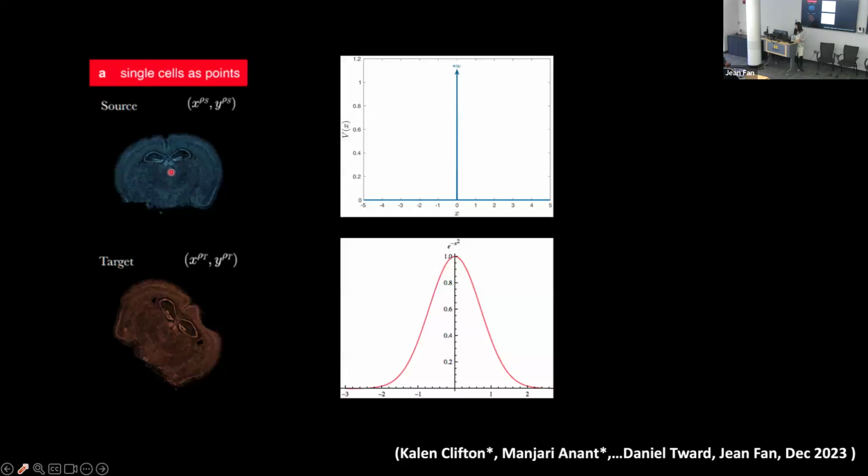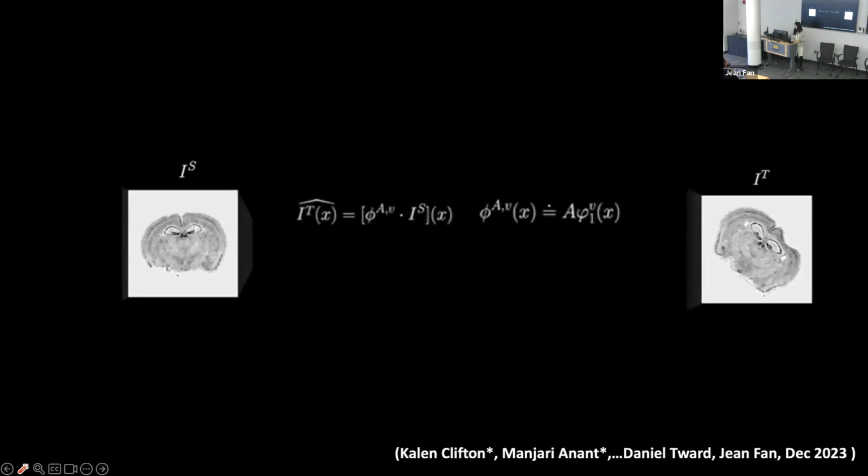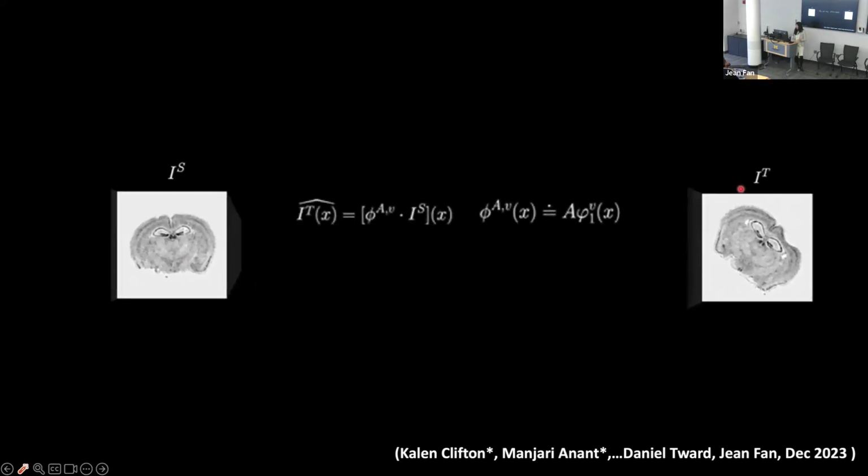And what we mean by this is we're essentially convolving a Dirac function with a Gaussian kernel to create this image representation of the spatial transcriptomics data set that is what we characterize as smooth. So that then allows us to make the image representation, which typically has fewer pixels than the number of cells, so it is a computationally more tractable problem.